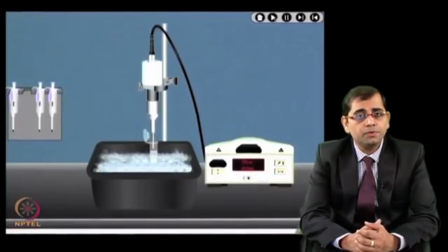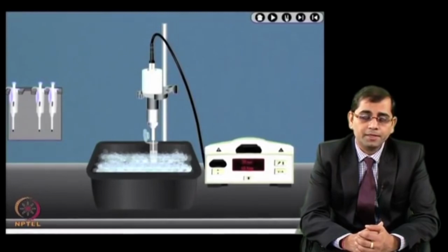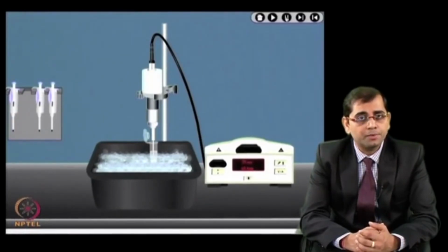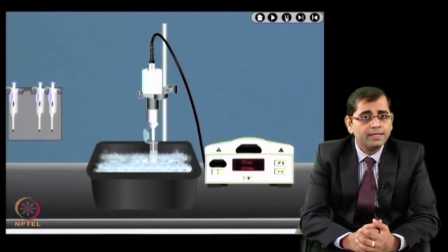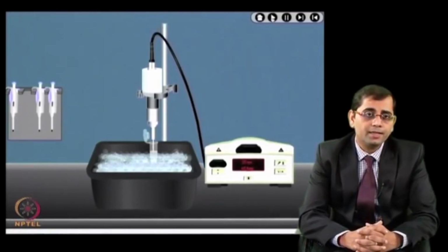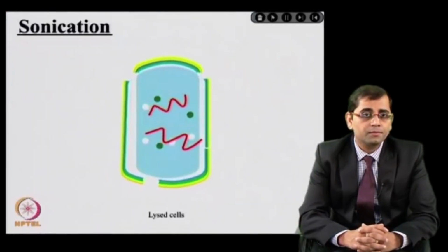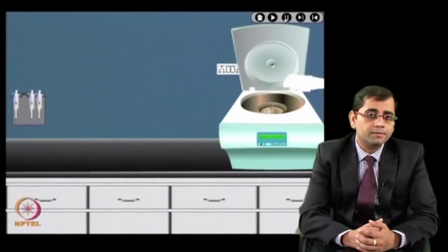In lecture 2, we'll talk about sample preparations for proteomics applications. Protein extraction is a crucial step for any proteomic investigation. The protein extraction method involves cell lysis, prevention of proteolysis during lysis, different types of protein precipitation methods, protein solubilization, and removal of various interfering components.